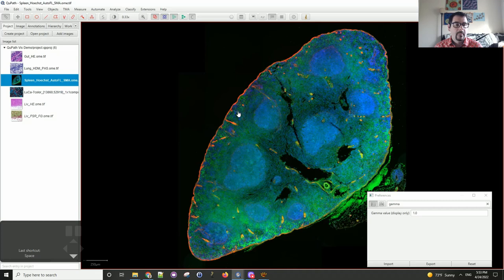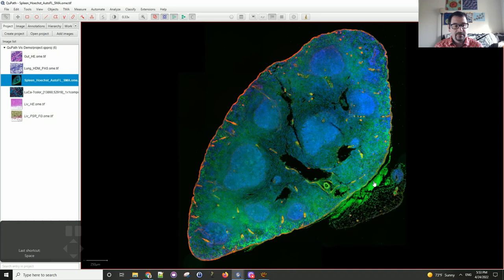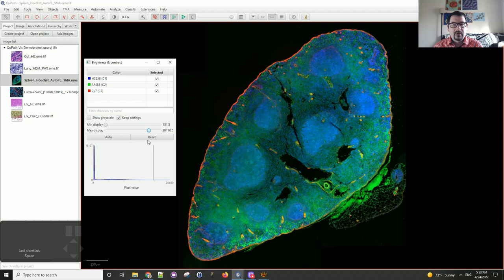Let's move to a fluorescence dataset. This is a piece of spleen that has been stained with smooth muscle actin, and there is a lot of autofluorescence in this tissue along with some nuclear labeling with Hoechst. I'd like to explore those channels one by one and work on those histograms, and the min and max display values, to optimize the image so I can see certain features a little bit better.